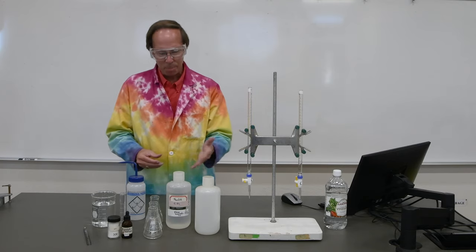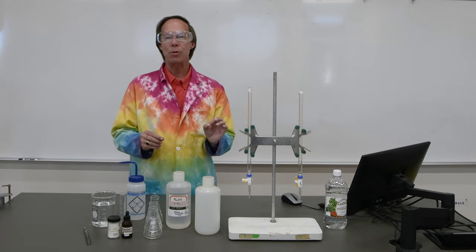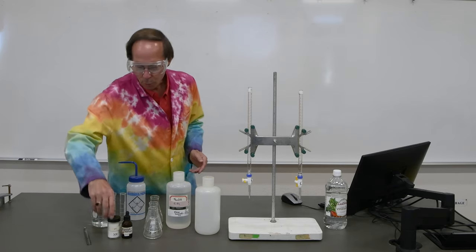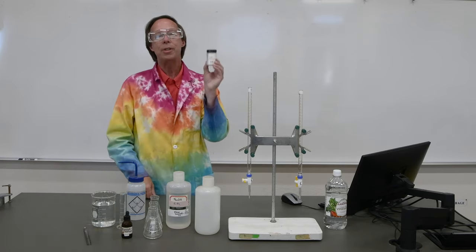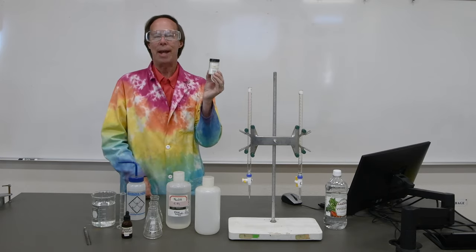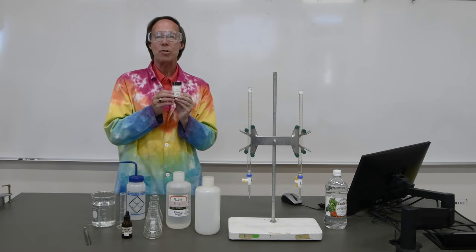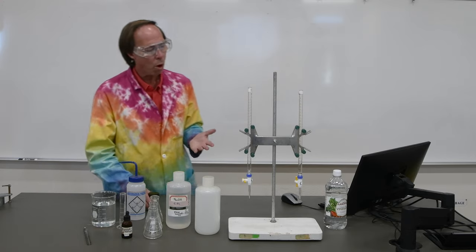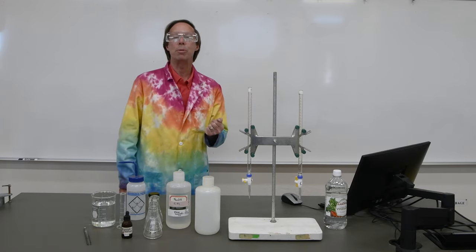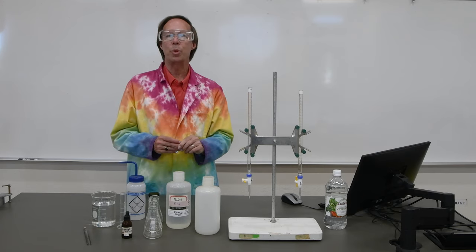So once we've made this approximate 0.3 molar solution of sodium hydroxide, we're going to standardize it to make sure we know precisely what its concentration is. To do that, we are going to use another acid called KHP, potassium hydrogen phthalate. The advantage of using a solid acid is we can weigh it out very accurately because it's in its pure form. So we're going to weigh a sample of this, dissolve it in water, and then we will add our diluted approximately 0.3 molar sodium hydroxide to it and determine precisely how much sodium hydroxide is required.